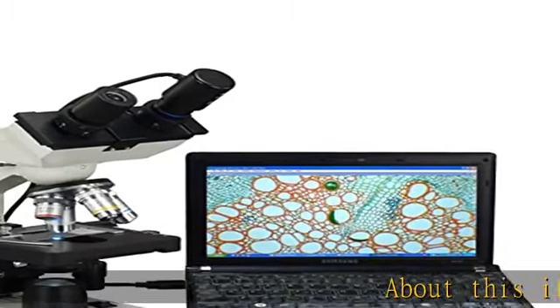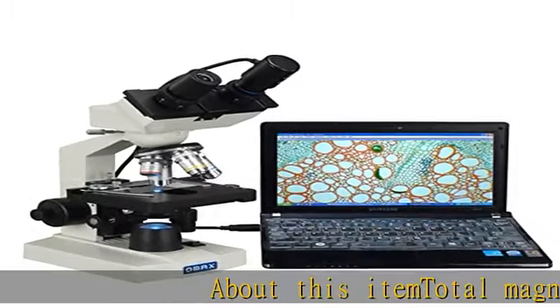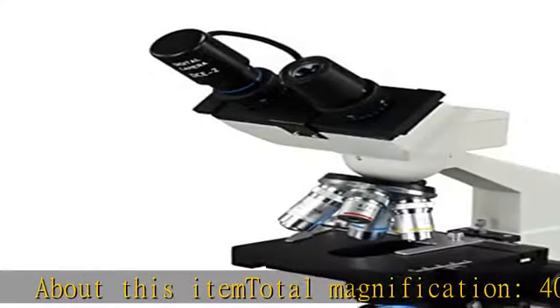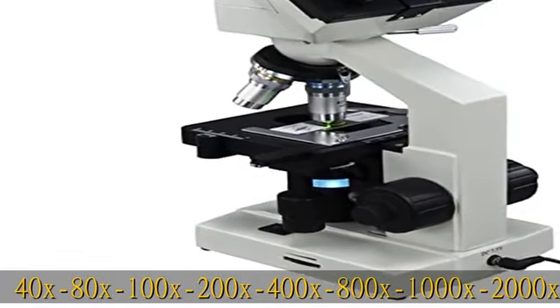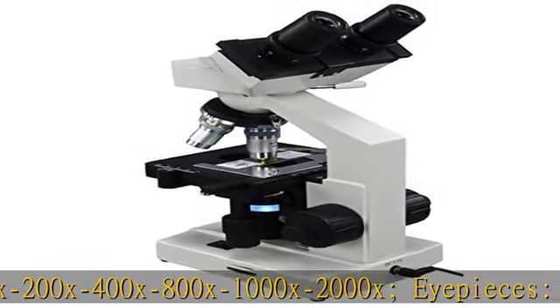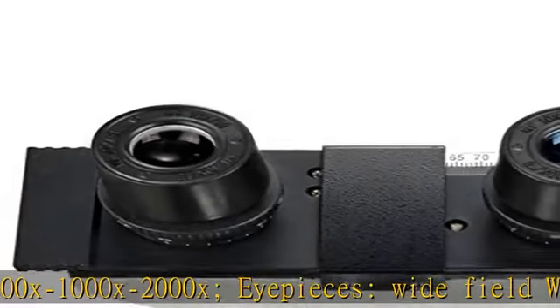About this item: total magnification 40x-80x-100x-200x-400x-800x-1000x-2000x. Eyepieces: wide field WF10x and WF20x.